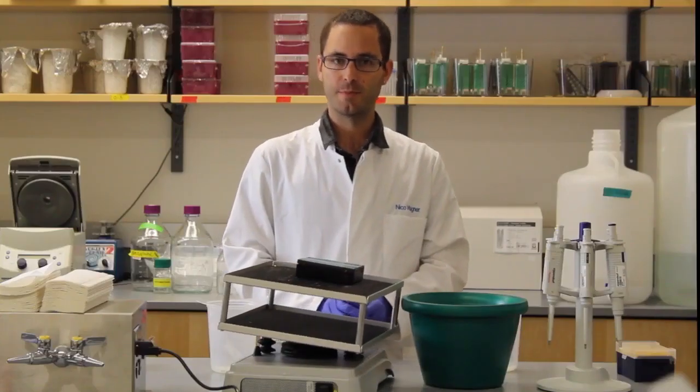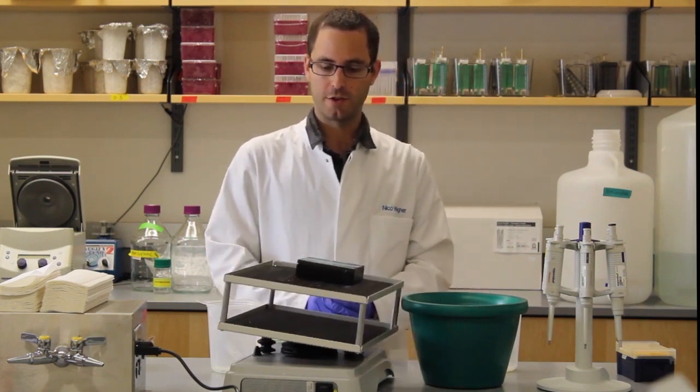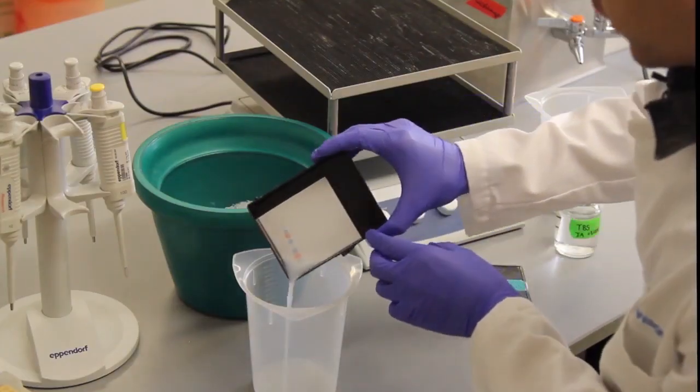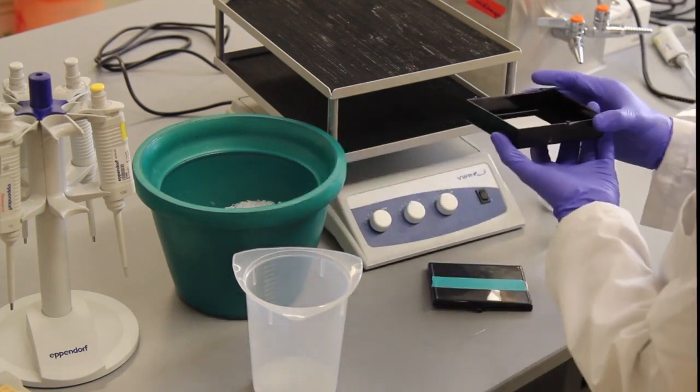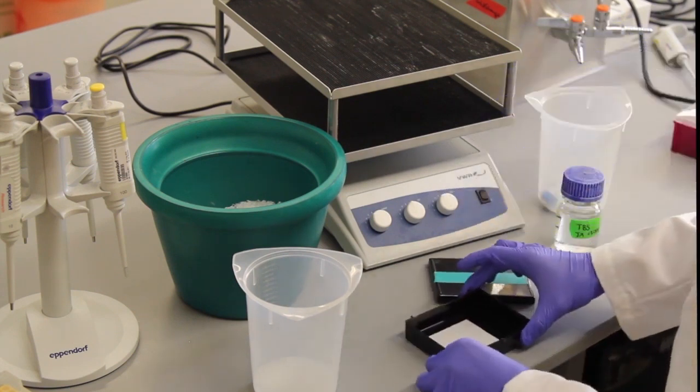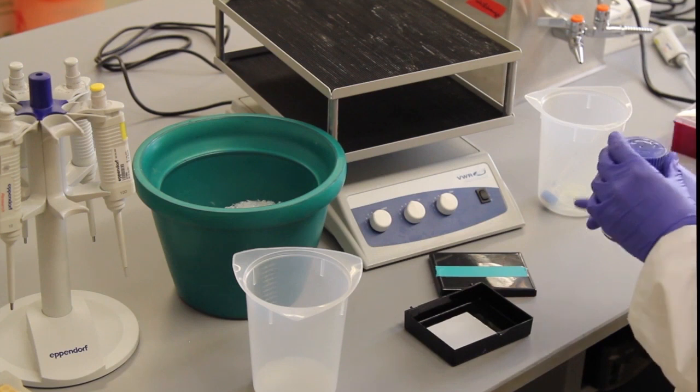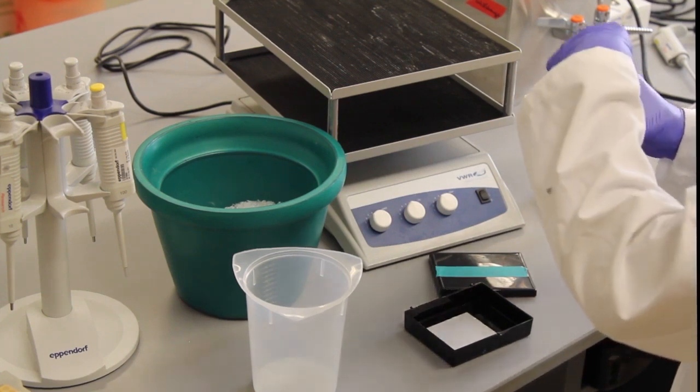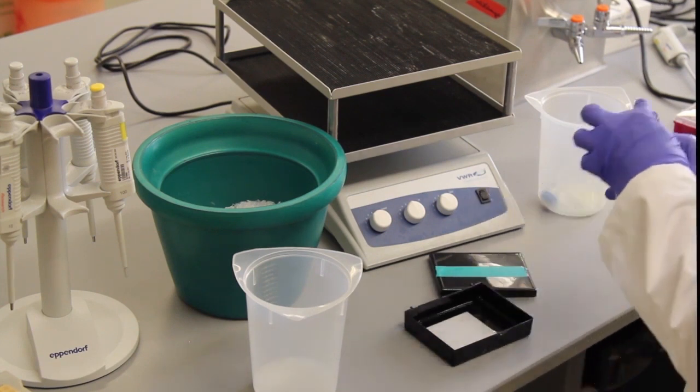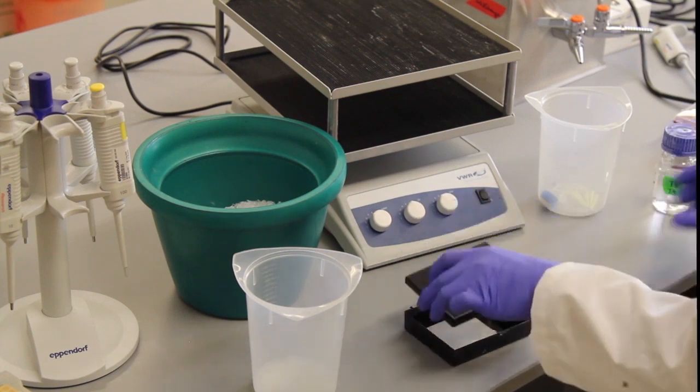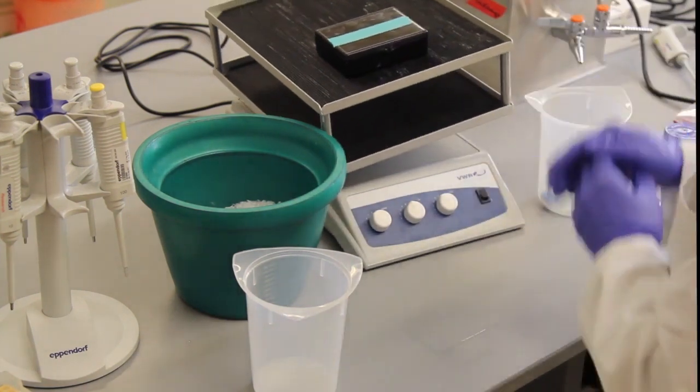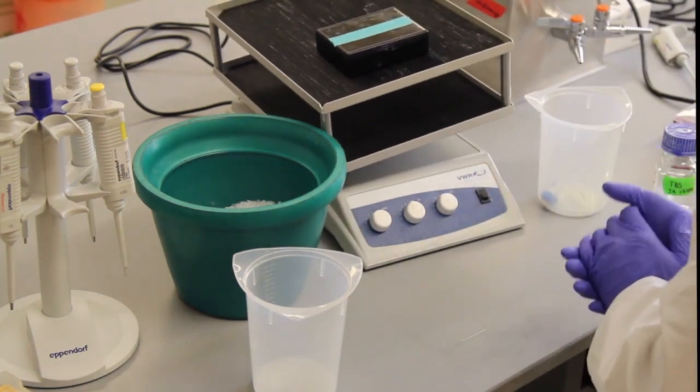The primary antibody has now been incubating for one hour. So I will turn this off, remove it. Again, dump off the supernatant. Certain primary antibodies, you can keep them and reuse them. This particular one, you can only use once, which is why I dumped it off. Prior to adding the secondary antibody, the membrane needs to be washed. We do this with a TBS-T buffer. Just add a little bit on top, just enough to cover the membrane. And add it back on the rocker for five minutes. And this washing step gets repeated two more times after this for a total of three washes at five minutes each.